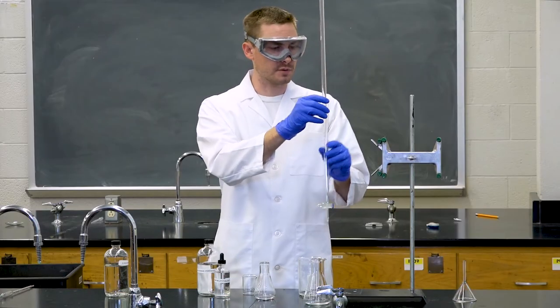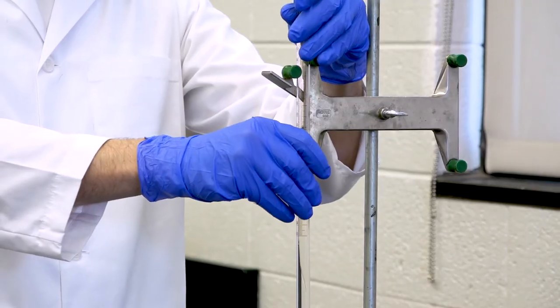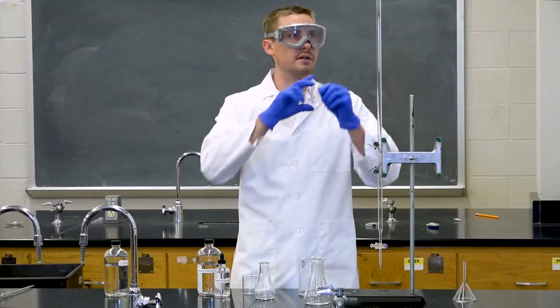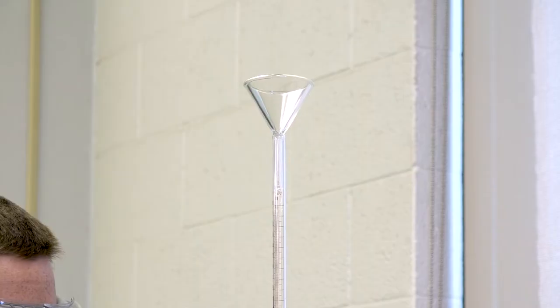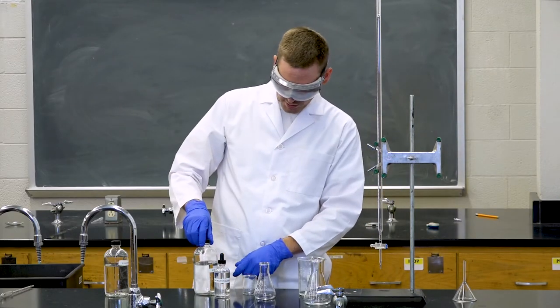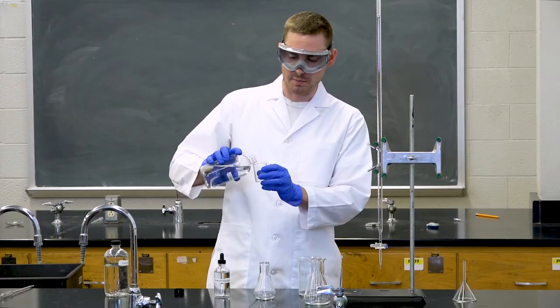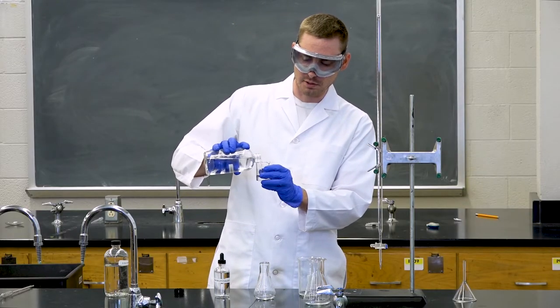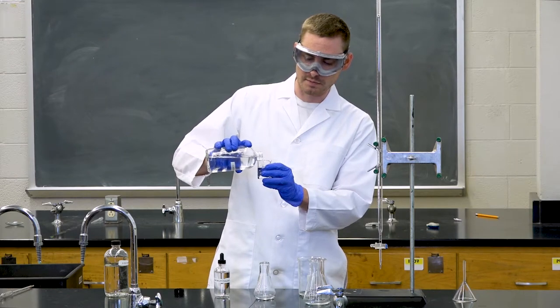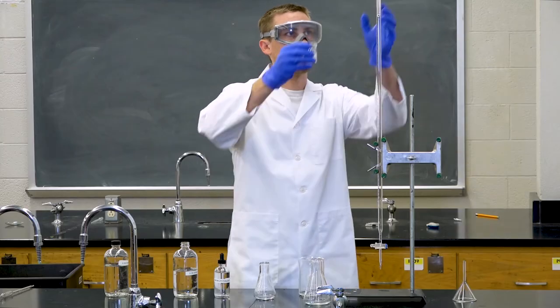So once your burette is rinsed, you can then put it back on the burette stand, and then place your funnel in the burette. And ensuring that the valve is closed, add your sodium hydroxide solution to a small beaker. You'll need about 40 to 50 milliliters to fill the burette, and then pour it into the funnel.